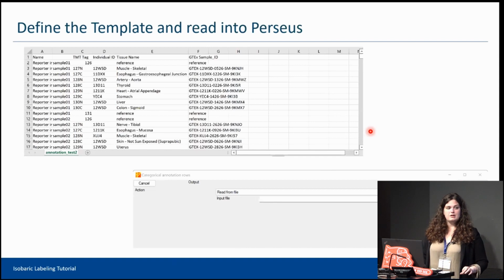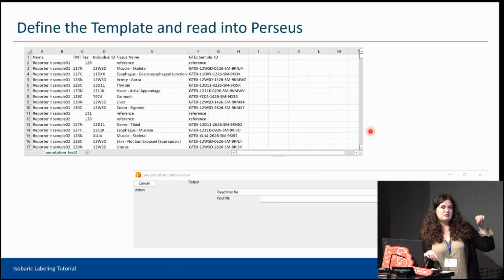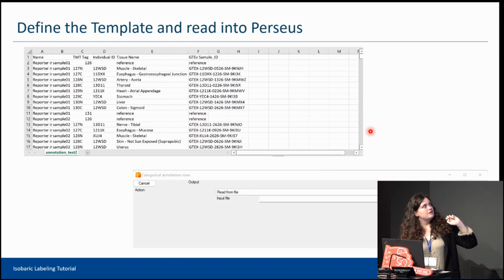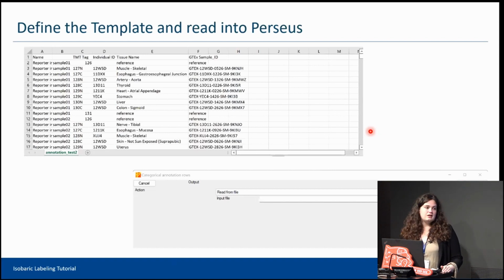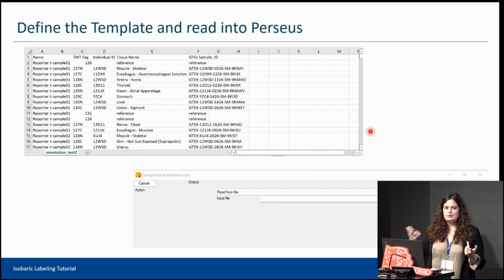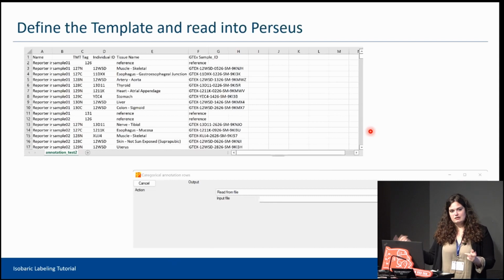So if you look at the paper and you go to the supplementary material, you will find as the first or second TXT file exactly this one. So all the information that you have is just copy and paste. Also, because I labeled all the samples as they are in the metadata, it was very easy for me to recognize which one each sample refers to. So that's why, again, I highly suggest that, even if it's a very long label, and sometimes it has some definition that maybe for you is not clear, at least with the metadata you can match each channel that you have.